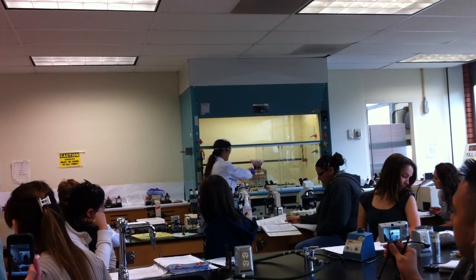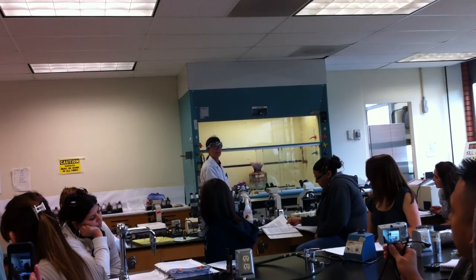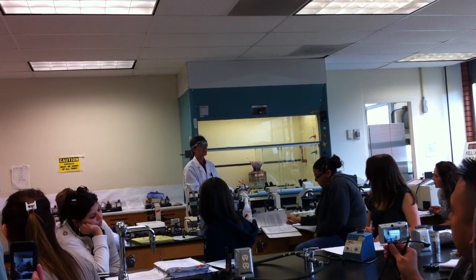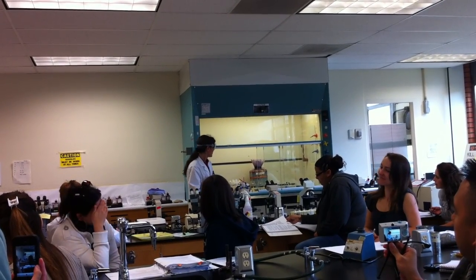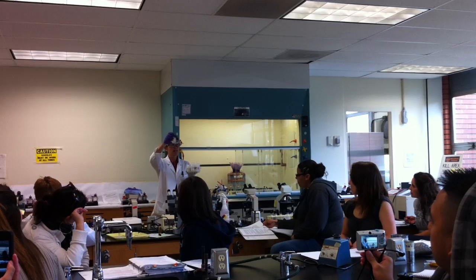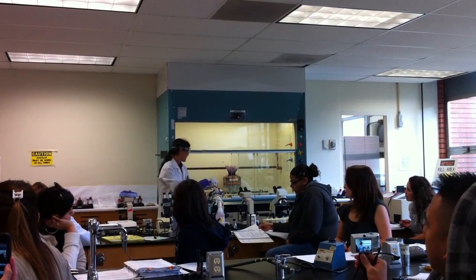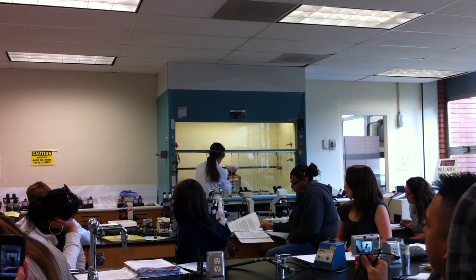Now we're going to add 5 drops of VP reagent B. What is VP reagent B? 40% potassium hydroxide, right? And it will burn your eyeballs out. So Val and Carmen have prepared the 40% potassium hydroxide. As always, you guys always read the label in case somebody's put the wrong bottle up here. So 40% potassium hydroxide. How many drops do I add? 5. Okay, so I'm going to add 5 drops.